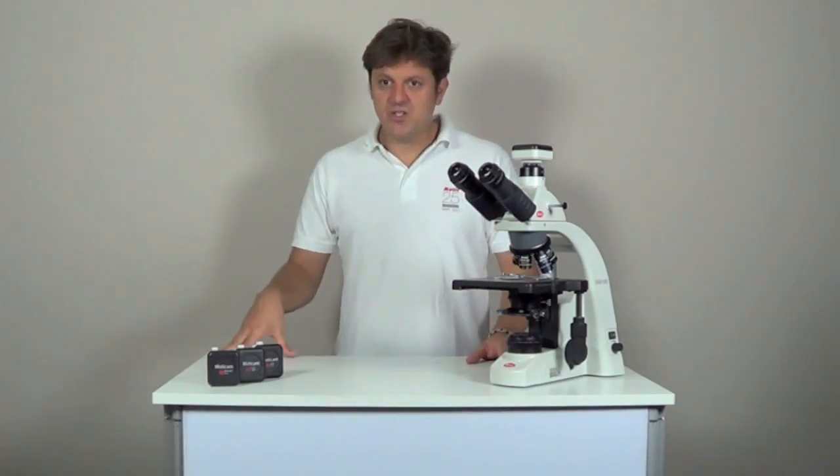Moticam standard live resolution cameras are introduction models in digital microscopy. They have a good quality sensor and are frequently used in education and smaller laboratories. Moticam 1 has a resolution of 800 x 600 pixels. It is a rather small image format, good for basic displaying of the image without need to zoom into details.